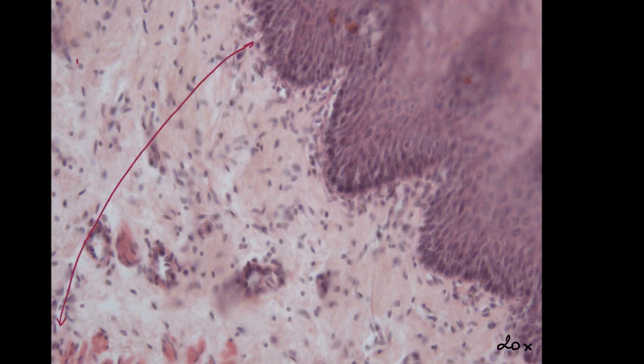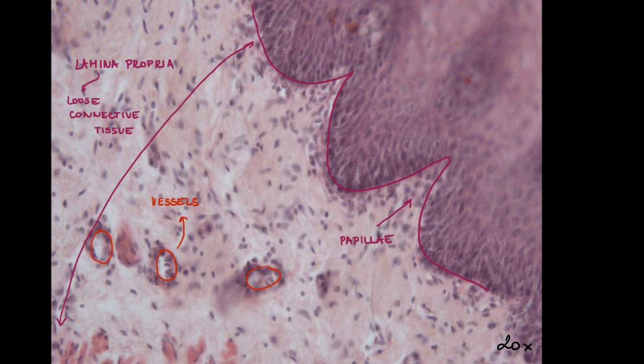Lamina propria is made up of loose connective tissue rich in blood vessels and creating papillae whose function is to anchor the epithelium. There are also esophageal cardiac glands in the section closer to the stomach, which secrete mucus.